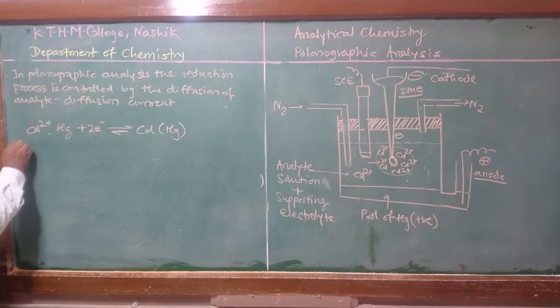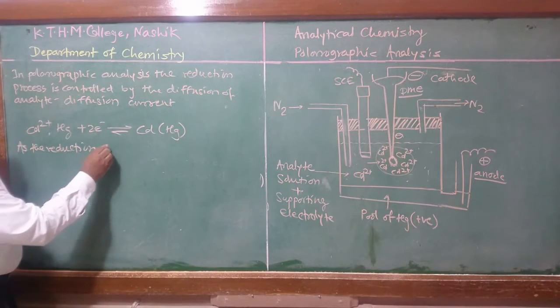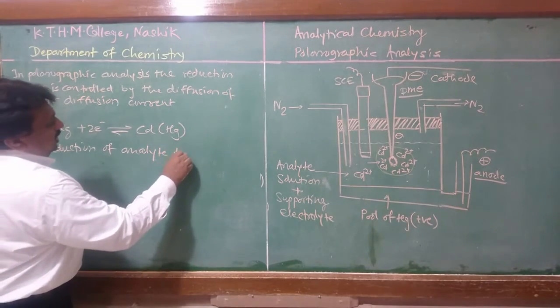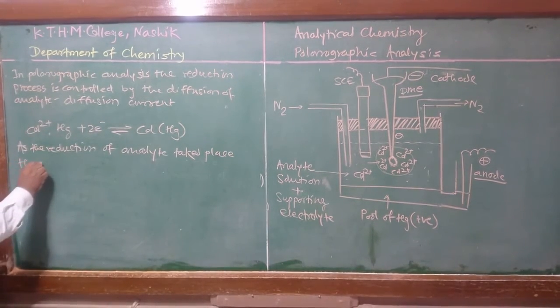Then, as the reduction of analyte takes place, the increase in current is observed.